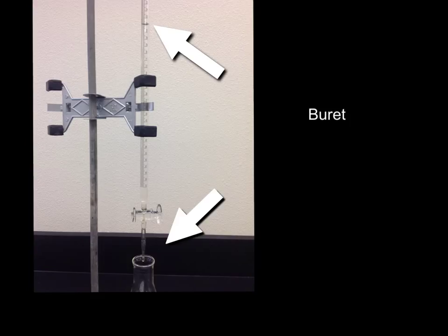The next piece of lab equipment has a very specific purpose. It's used for a lab technique called a titration, and this is something that we'll get to later on in the spring when we get to acids and bases. But the purpose of a burette is not to contain a liquid and measure how much liquid is in the container like a graduated cylinder, but it's actually used to dispense a liquid. So you can see at the top arrow, there's the level of the liquid, but the numbers are increasing as you go down. So as the liquid comes out where the bottom arrow is pointing, you're actually measuring how much liquid comes out of the burette. So it's used to dispense liquid rather than actually to hold liquid.